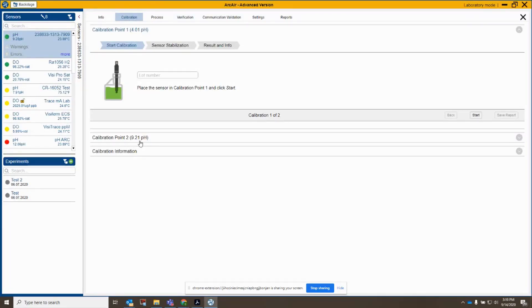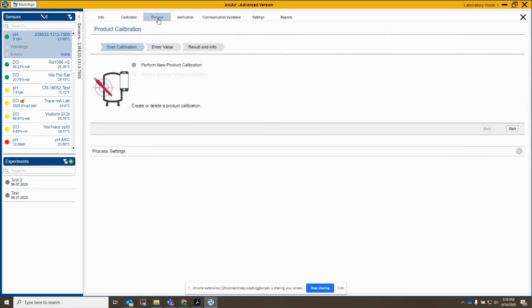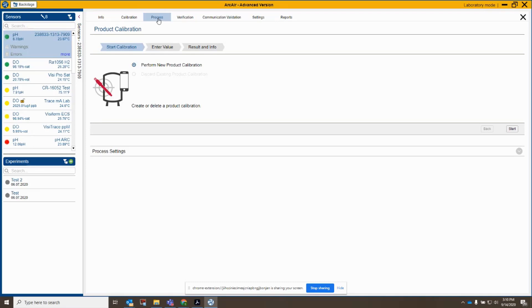So the next thing we're going to try here is the process or product calibration. That's the next tab over here. And this is a calibration that's typically done by comparing the pH sensor in the process with a sample of that process. So you're taking a slipstream or a grab sample of that process, measuring pH, and using this to offset the value. In this case, I don't have a process, but I'm going to place the sensor back in my 7 pH buffer here, and I'm going to perform a new product calibration. So let's click start here.